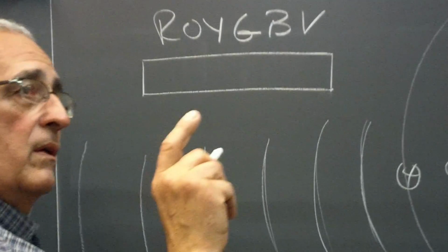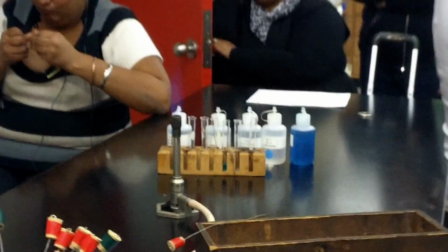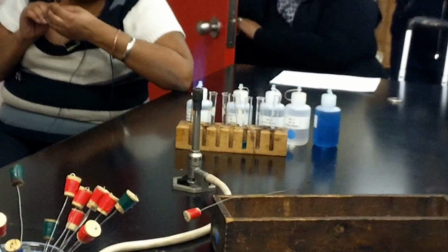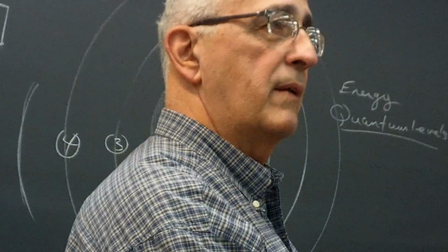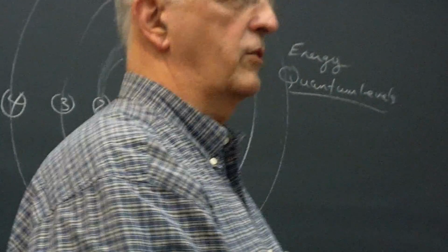So those devices there on that desk will be used by the whole class. You have to kind of take your turn. It might take a little bit of practice to learn how to use them. The key is don't touch the instrument, not because it can break. They're very, very durable. It's because they're focused on a very, very intense beam of light, and we don't want to move it. If you move it, then you lose the beam of light. We'll have to reset it for you. It's not critical, but just try not to touch the instrument.